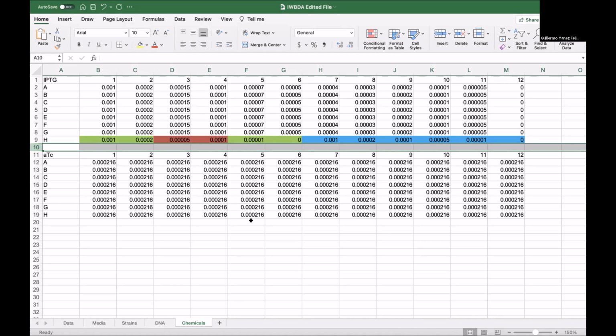No, it's okay. Maybe you thought that the chemicals were just for inducers or chemicals like that, but it's actually for anything you would like to include. Antibiotics. We were including also cell-free chemicals concentration. So it's pretty flexible in that sense, because then when you go and query your data, you can just filter by antibiotics, for example, for some antibiotic, and then you can see how your data behave depending on changing each of the chemicals in a Hill function, for example.